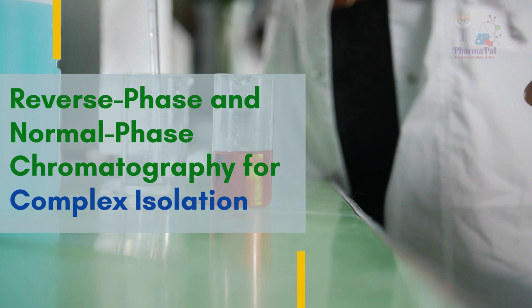Let's get started. To devise a separation scheme for isolating and purifying caffeine, acetaminophen, and aspirin from a tablet, you need to understand several key concepts related to their chemical properties. Here are the main concepts to consider. Solubility: each compound may have different solubility in various solvents. You can exploit these differences by selecting solvents in which one or more of the compounds are soluble while others are not. For example, you might use water, ethanol, or dichloromethane as solvents, depending on the solubility profiles of the three compounds.